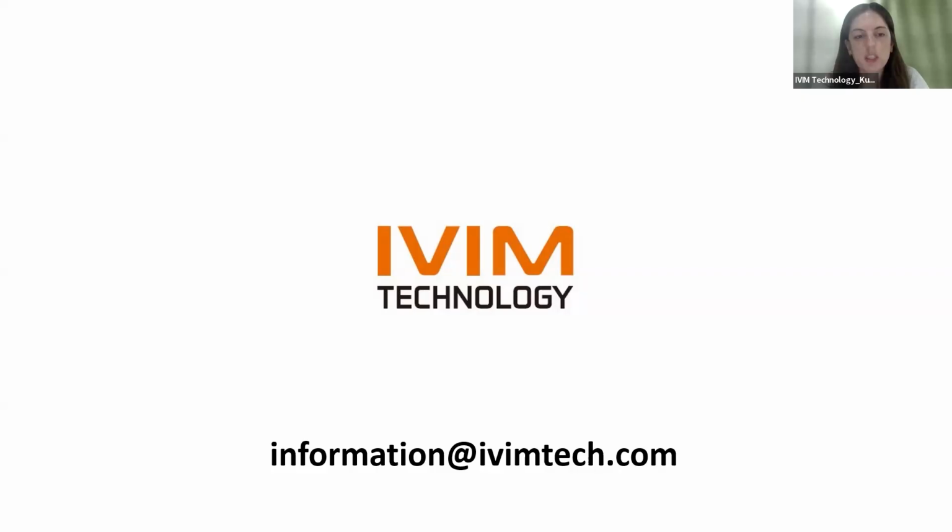Thank you for the answer. Another question is about the equipment, and it's a technical one. What is the temporal resolution and frame rate achievable with your multicolor real-time imaging setup during in vivo experiments?